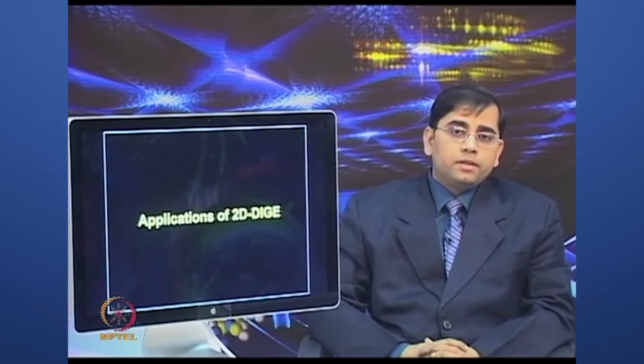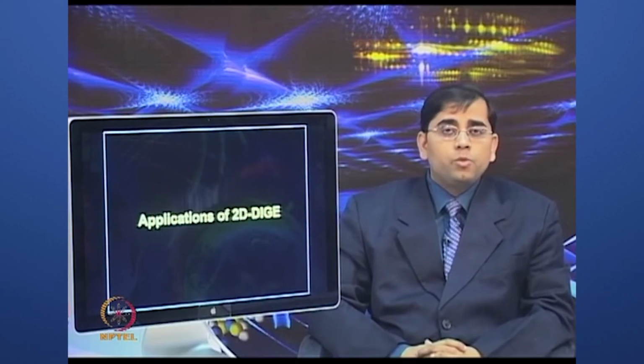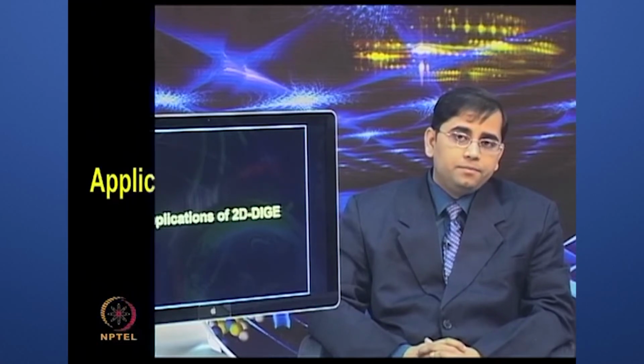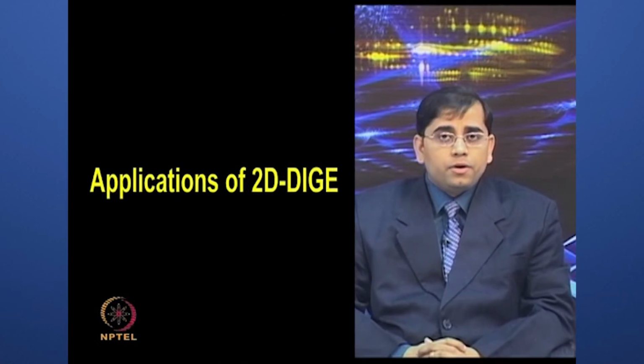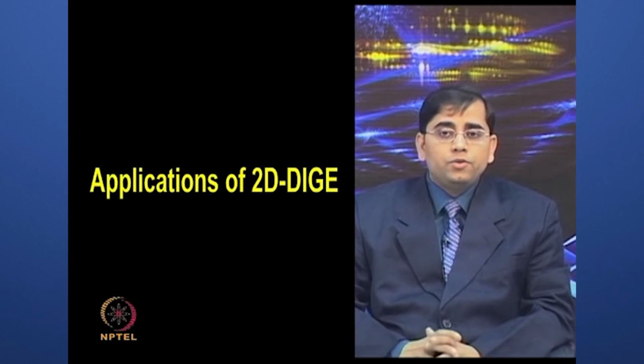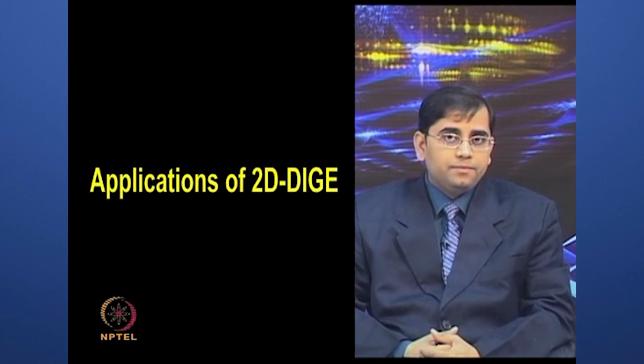So, overall the DIGE method is far superior in terms of reproducibility as compared to conventional two-dimensional electrophoresis, and for quantitative accuracy. Therefore, applications of 2D DIGE can be found in virtually all major biological research areas.